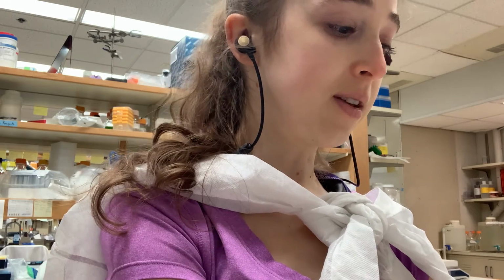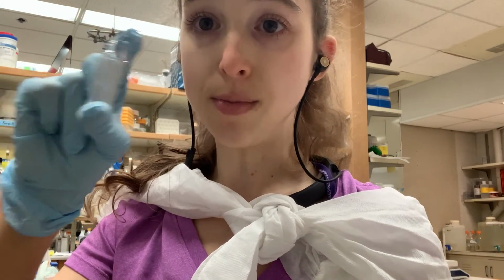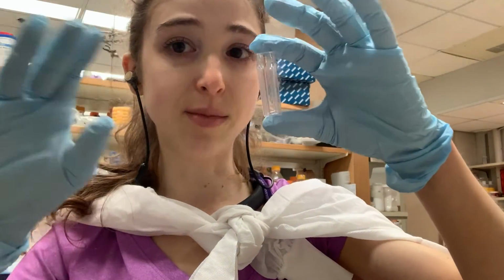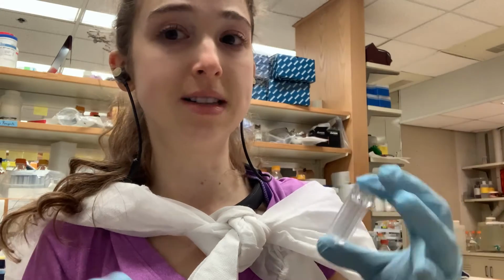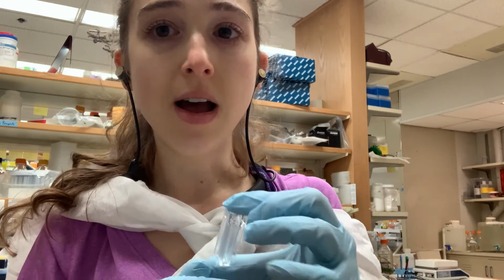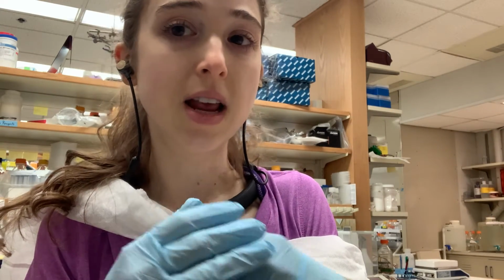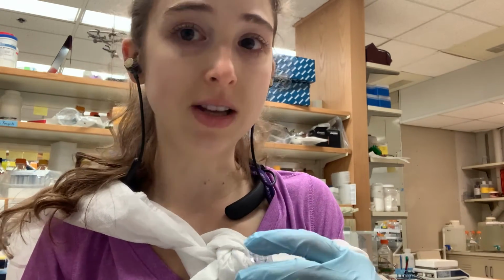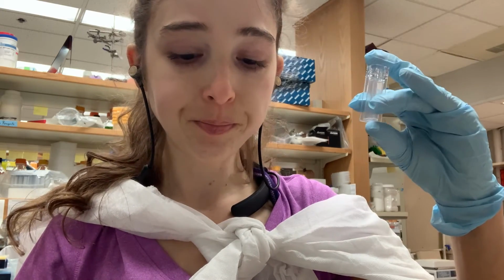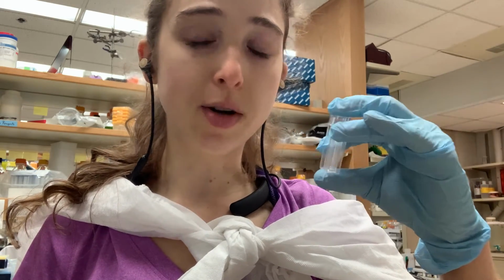And so thankfully for us, most cuvettes are standardized to have a 1 centimeter path length, and the nanodrop automatically calibrates things so that it's measuring as if it were a 1 centimeter path length when it gives you the values. So this is going to allow us to make some simplifications and take some shortcuts in our calculation, using standard coefficients for DNA and RNA that are based on having a 1 centimeter path length.